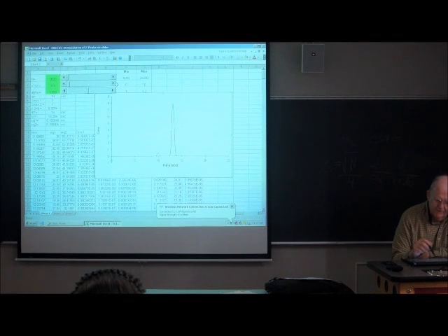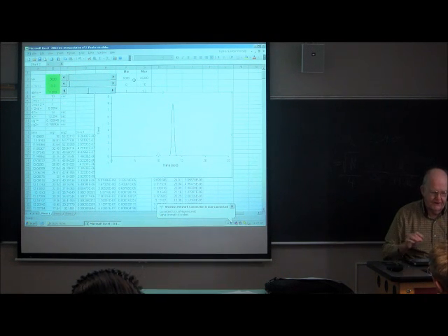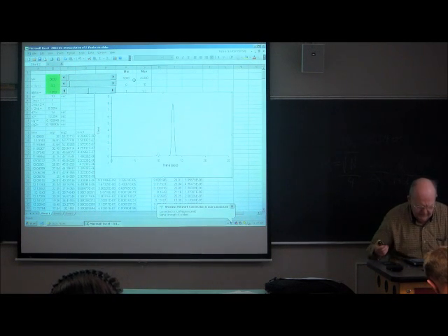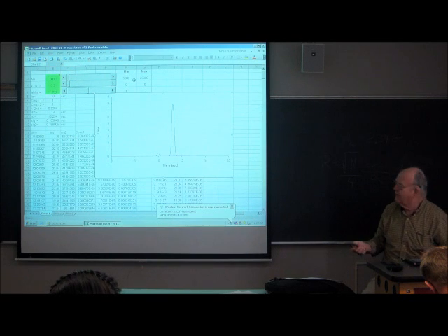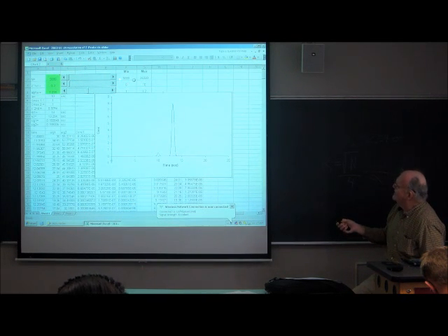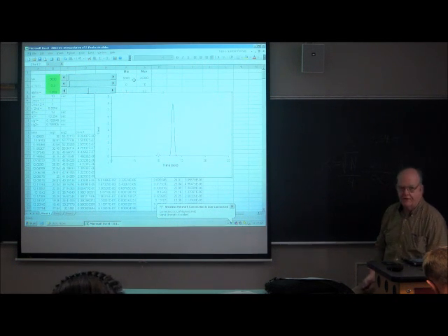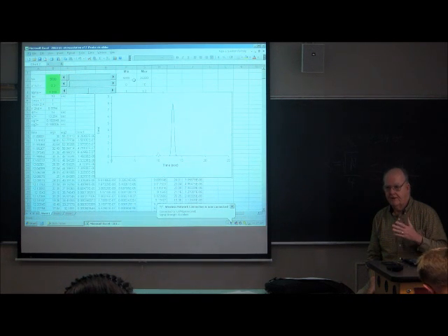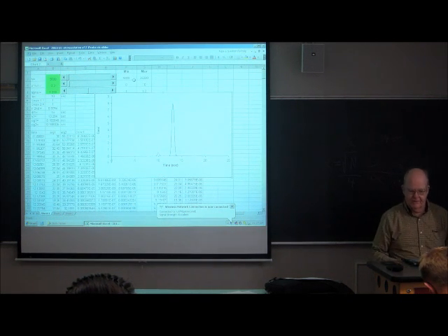And I've got it built into this spreadsheet with sliders. For the plate count, you can only go from 5,000 to 25,000. For the retention factor of the first peak of a pair of peaks, you're only allowed to change it from 0 to 10. And then the selectivity factor, the last slider, we're only going to let it vary from 1 to 1.2. It's a very narrow range compared to the other variables. Okay, we're going to see what happens as we change the parameters.